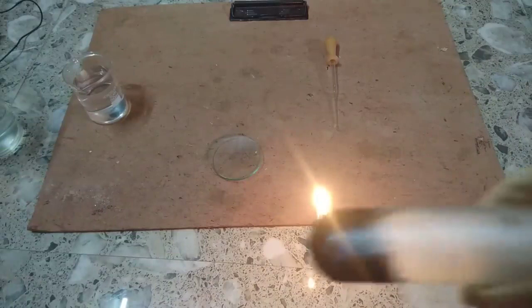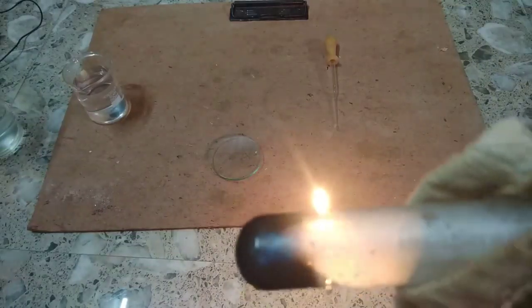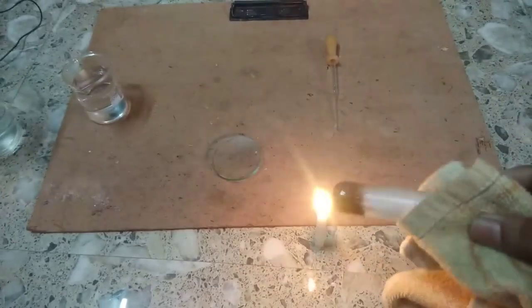And you can see very clearly that water of crystallization is on the test tube. That means it loses its water of crystallization, that is 5H2O. Therefore, the reaction will be CuSO₄·5H2O gives CuSO₄ plus 5H2O. It loses its water of crystallization.